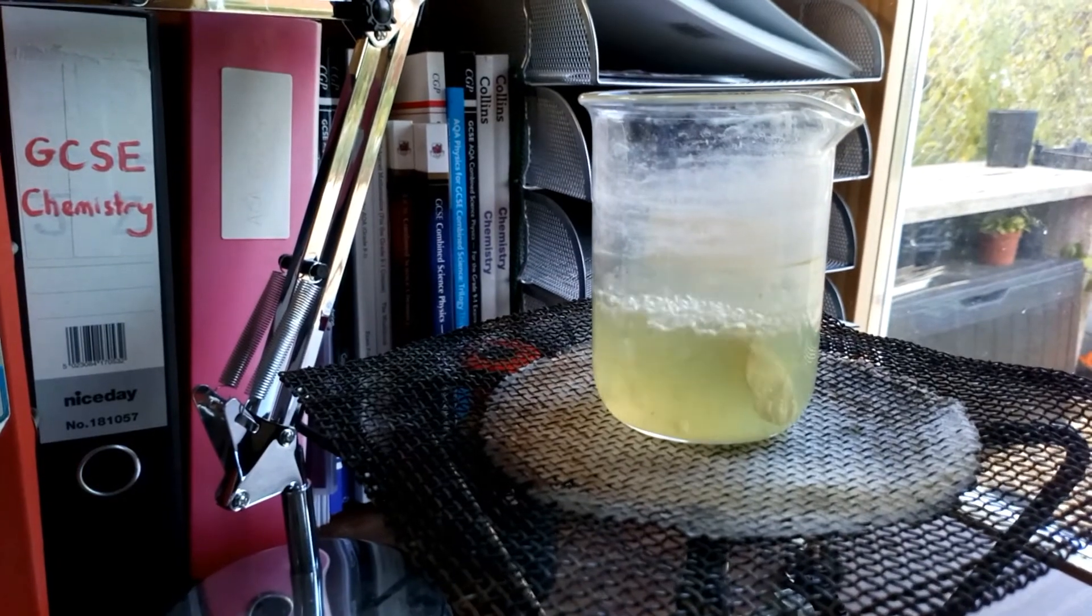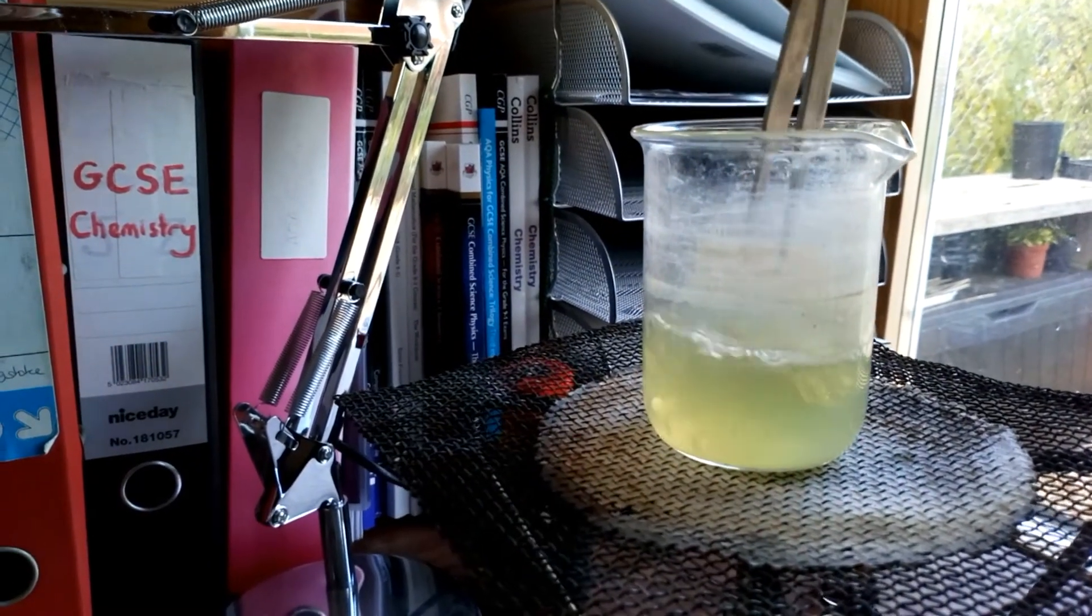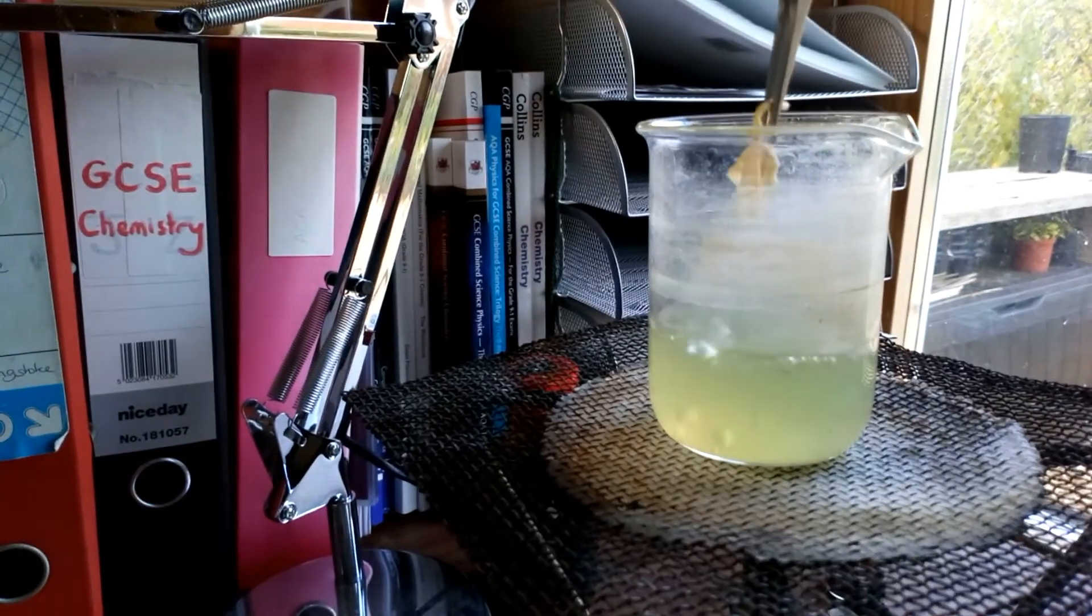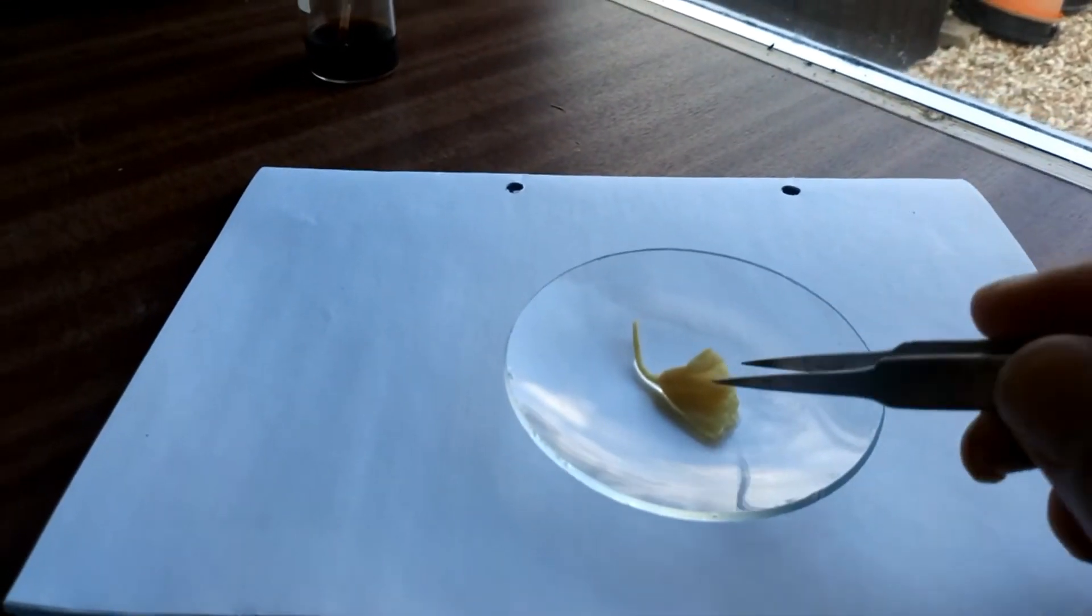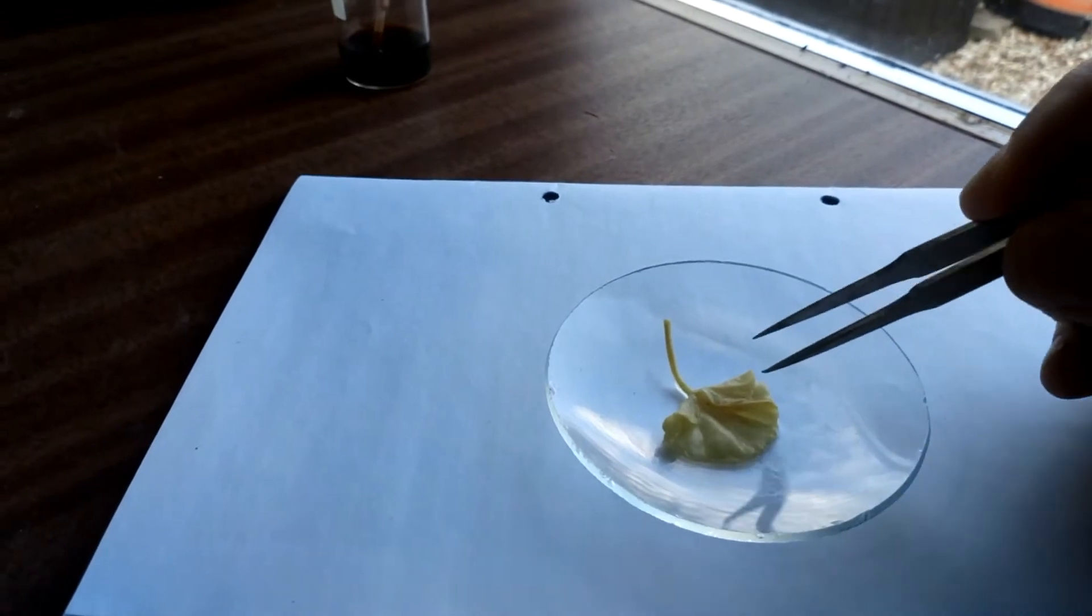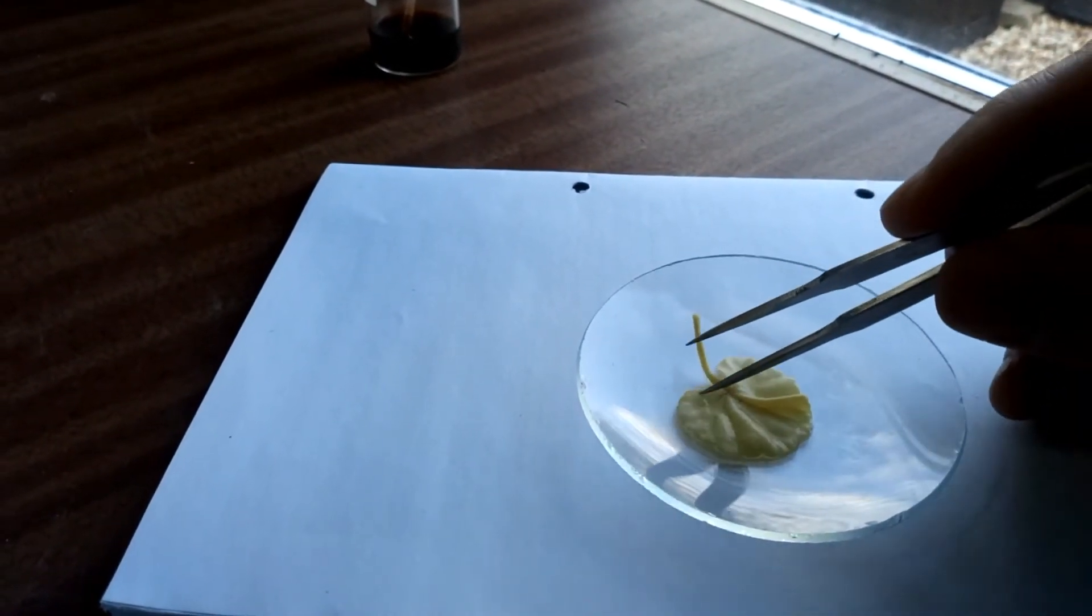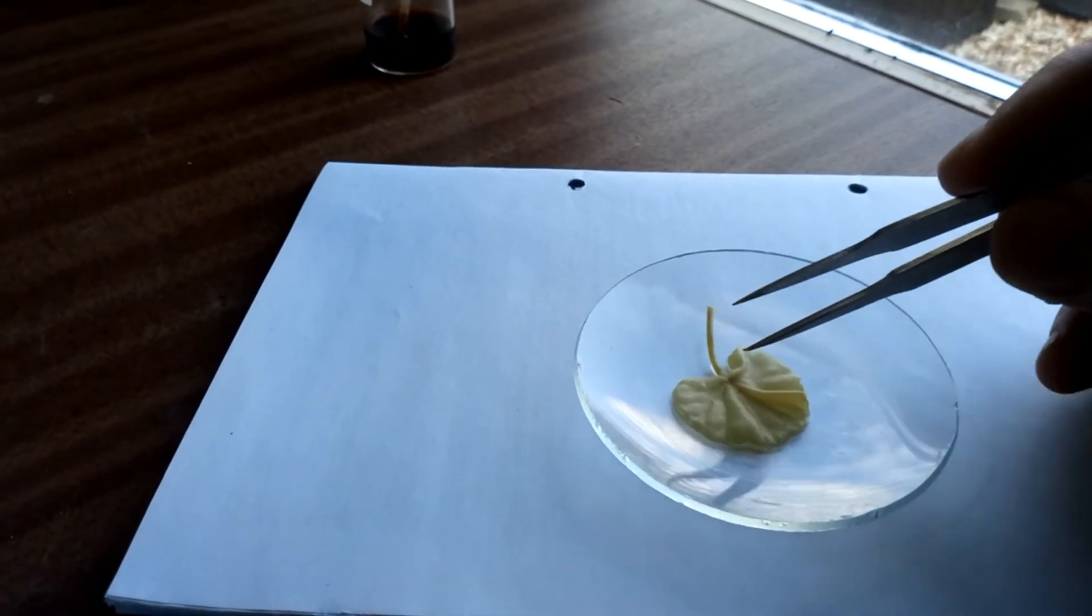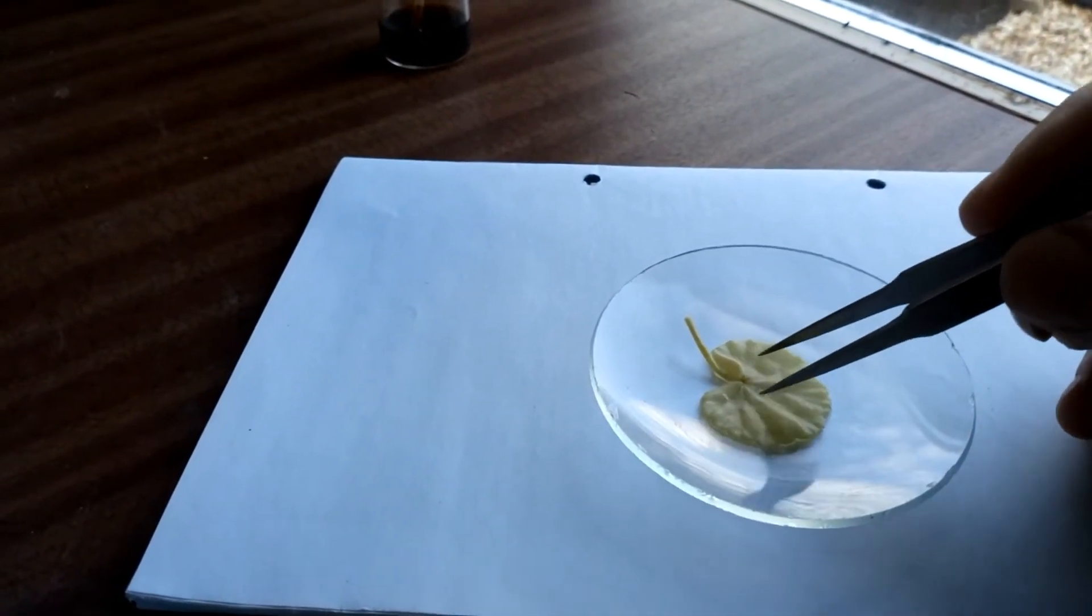And now we'll remove the leaf from there. You can see now it's gone quite floppy. And then we're putting that down onto the dish there. And then we should be able to spread it out onto the surface like that.